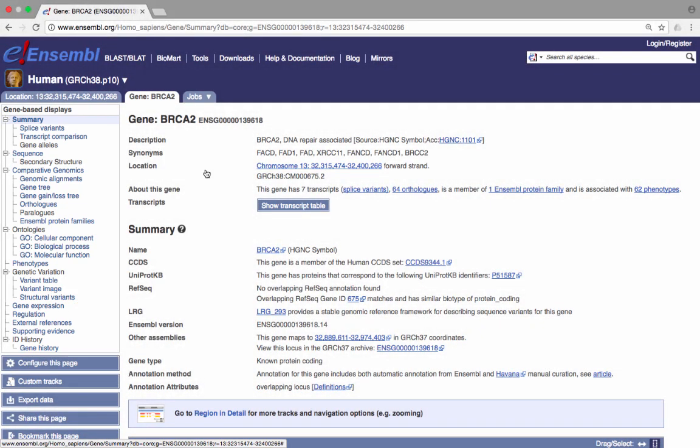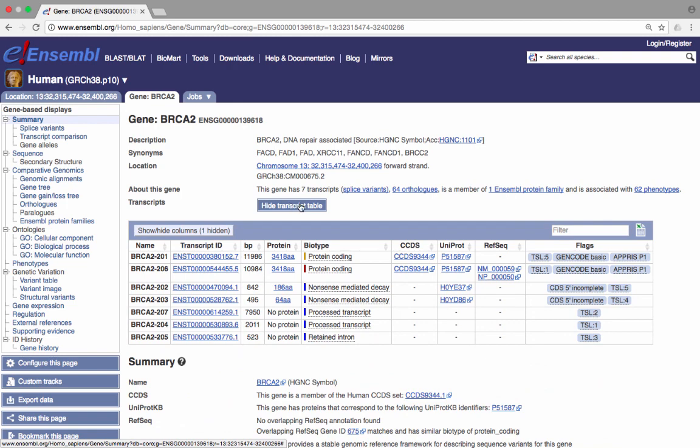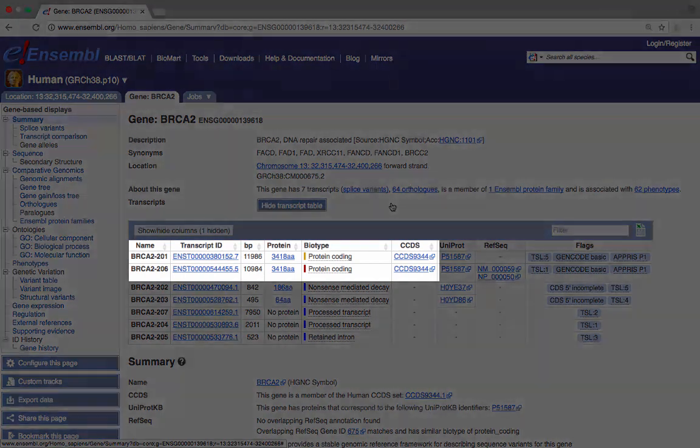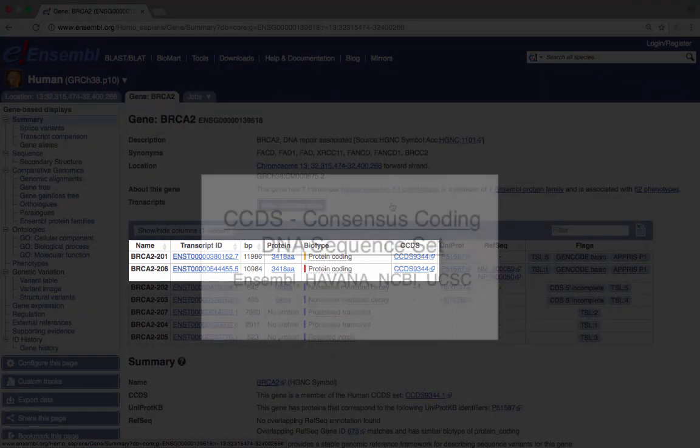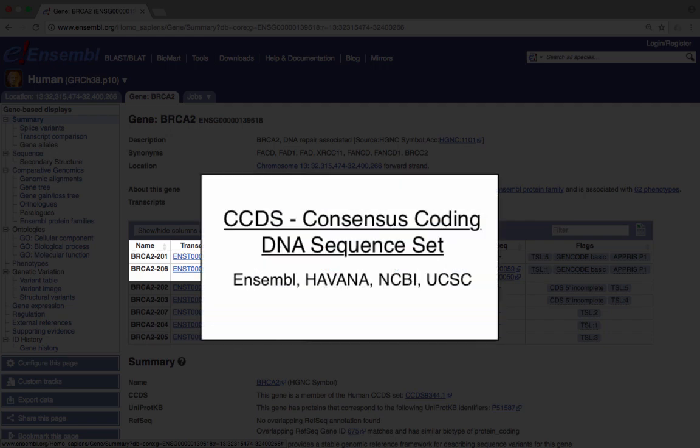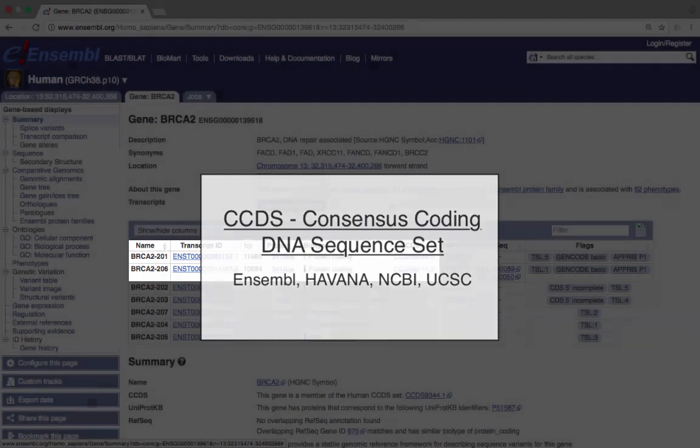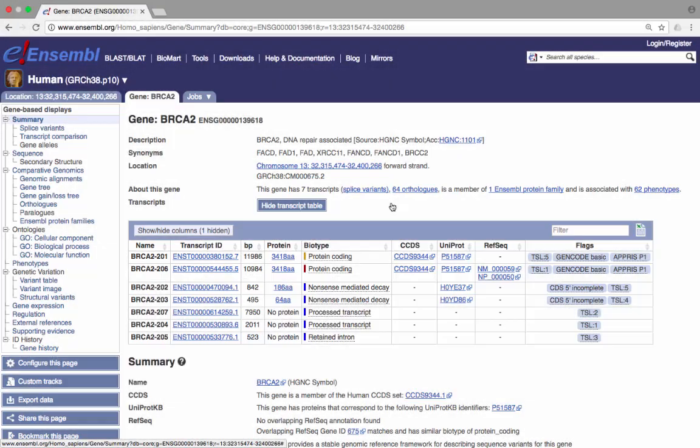From this gene summary page, we can see that seven transcripts have been annotated. To see more information about these transcripts, we can click on Show Transcript Table. Two of these transcripts are members of the CCDS set, a consensus set of coding sequences established as a collaborative effort between the Ensembl Project, Havana, NCBI, and the UCSC Genome Browser.